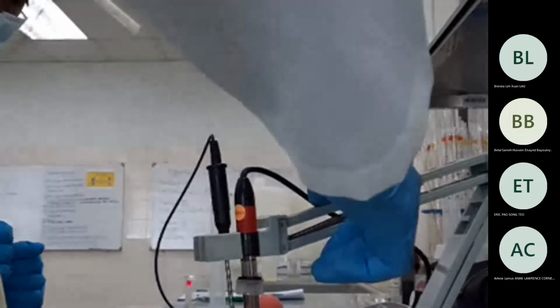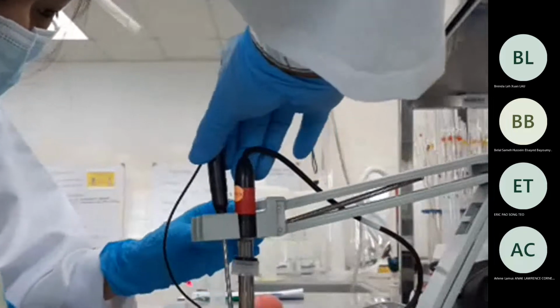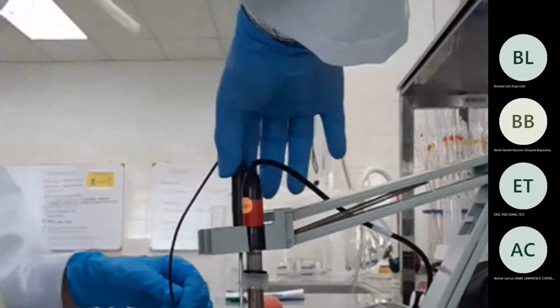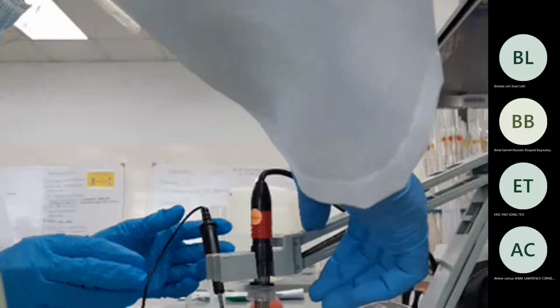It's not touching yet. You have to make sure that both the probe and this electrode touch. Now it's touching, and it has to be immersed inside, okay?